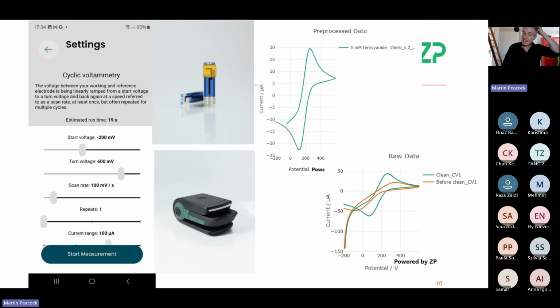What's not talked about, but thanks to the interaction with some of you, I have now started to promote the idea of cleaning screen-printed electrodes with acid solutions, and I think they withstand acid solutions really quite well. And how will I make you believe that or not believe it? I will just show you. So I'm about to do 3 experiments, or 2 experiments and a cleaning step. So without cleaning, then I'll clean, and then after cleaning, we will have a look at that data.